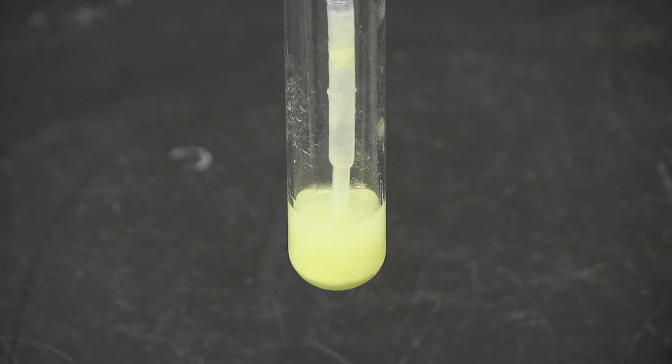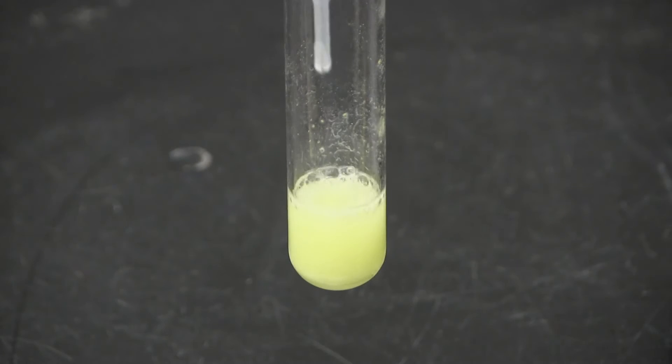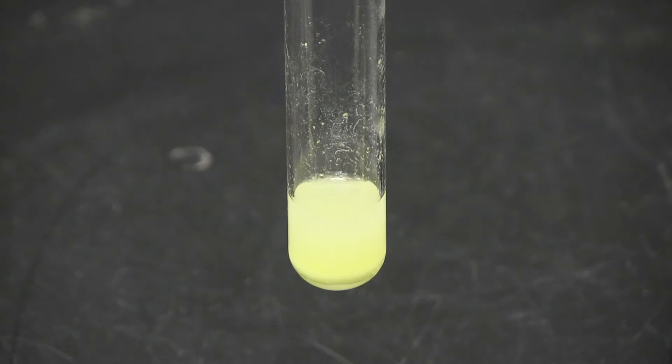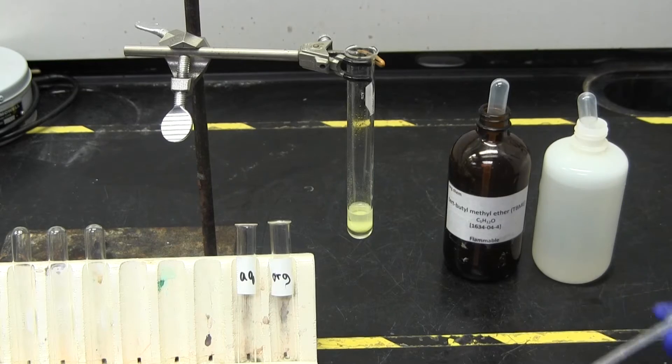Say you want to extract with one milliliter of solvent. You should add a half a milliliter, mix, allow the layers to separate, and then add another half a milliliter of extraction solvent, and repeat. Be sure to keep track of which layer is which — labeling test tubes is a good idea.